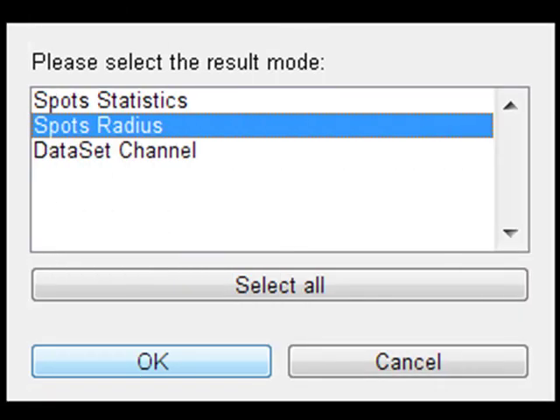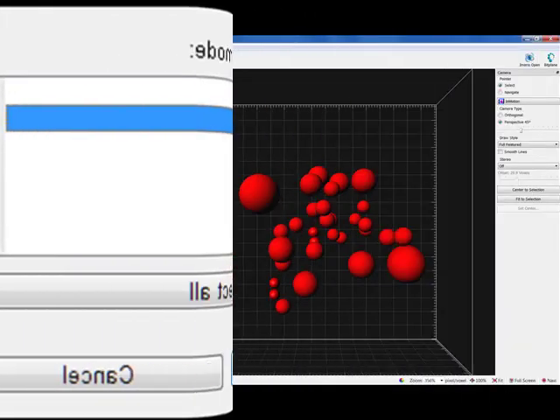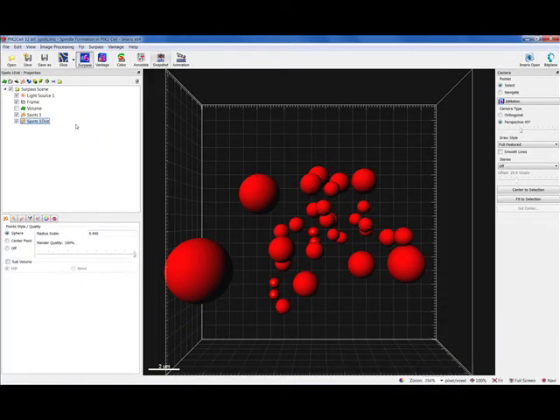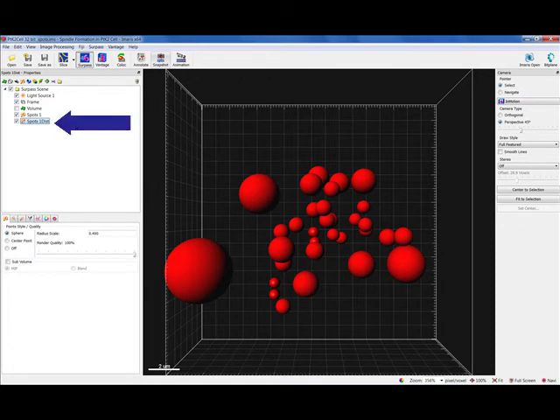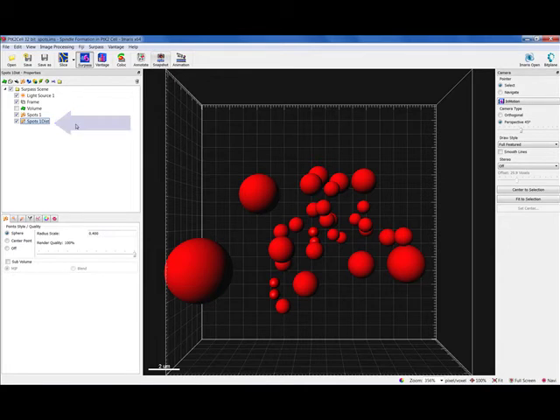If you select the Spots Radius option and start from all spots that are the same size as in this tutorial, after running this extension, a new Spots object is created and the Distance value is encoded to the spot's radius.